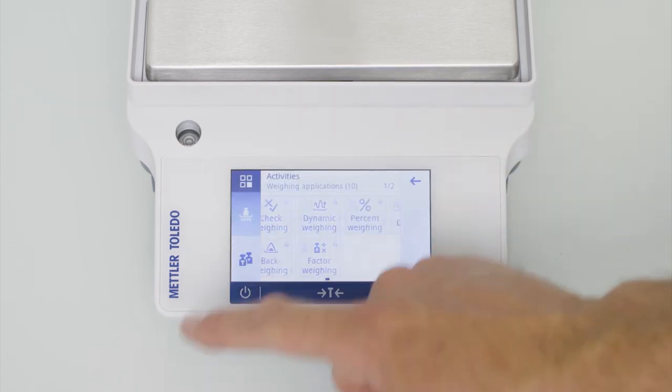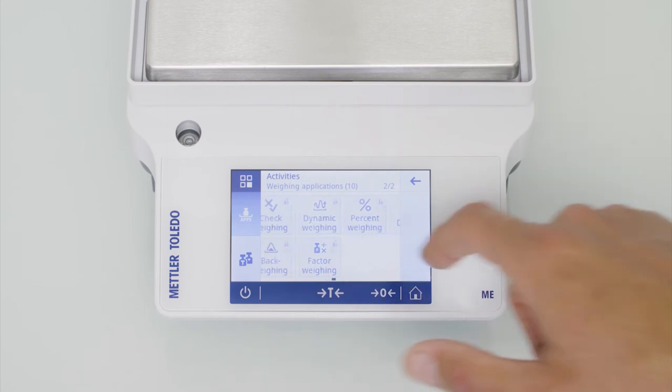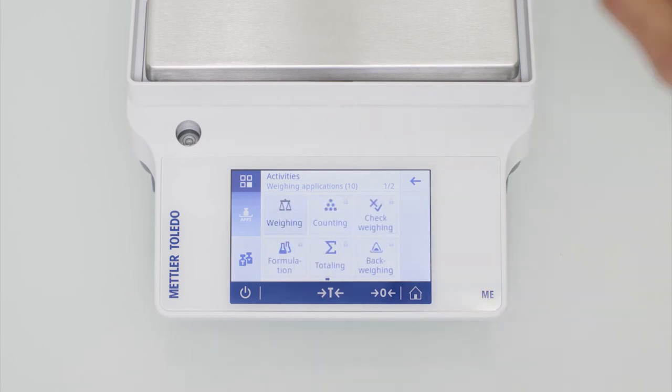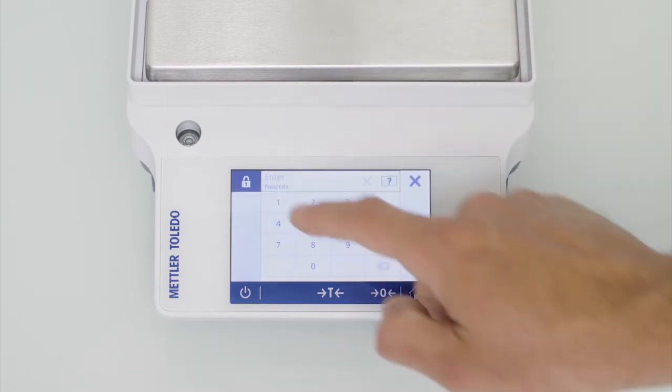Ten embedded applications permit you to start working right away thanks to on-display step-by-step guidance. Applications include check weighing, piece counting and formulation.